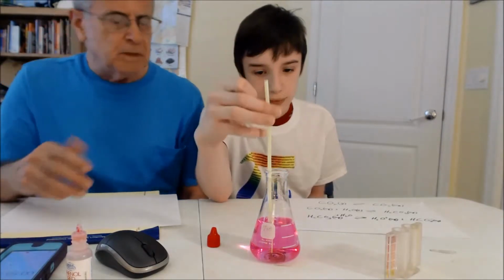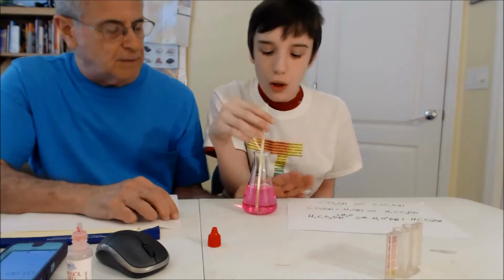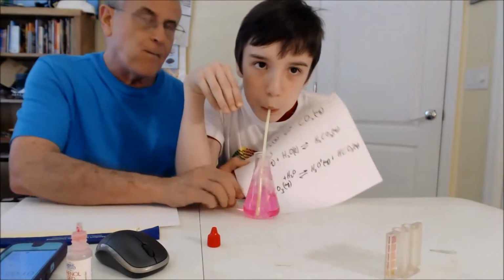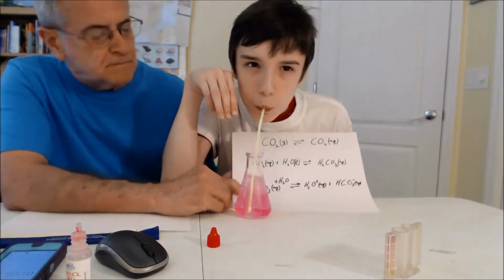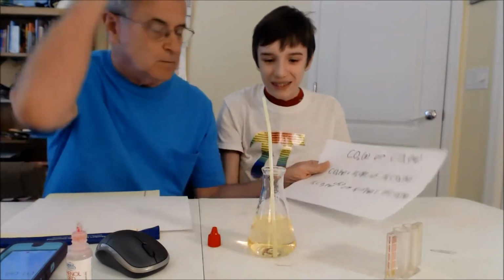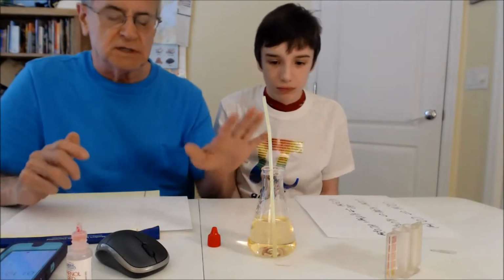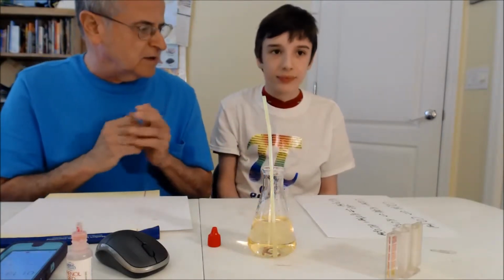Now, Pi Guy is going to blow his breath in there and see what happens. Okay, very good. They made a little mess here, but that's good. All right, so it obviously turned from a basic solution to an acidic solution. What's coming out of your breath?